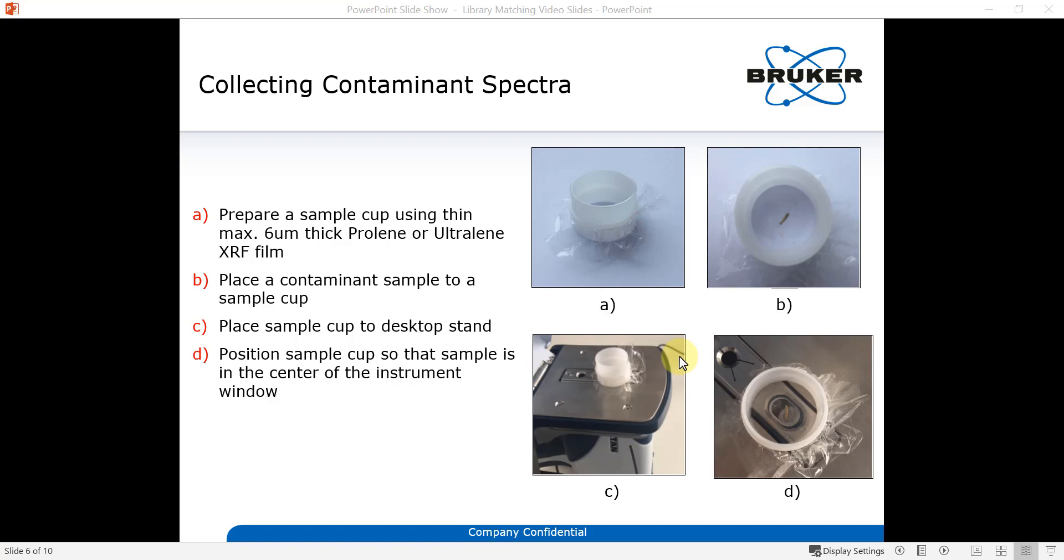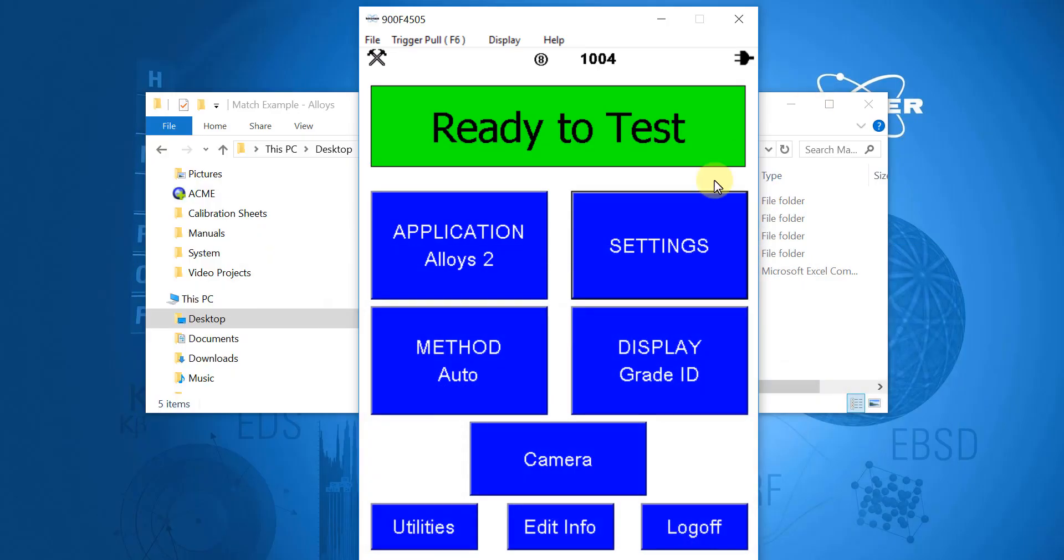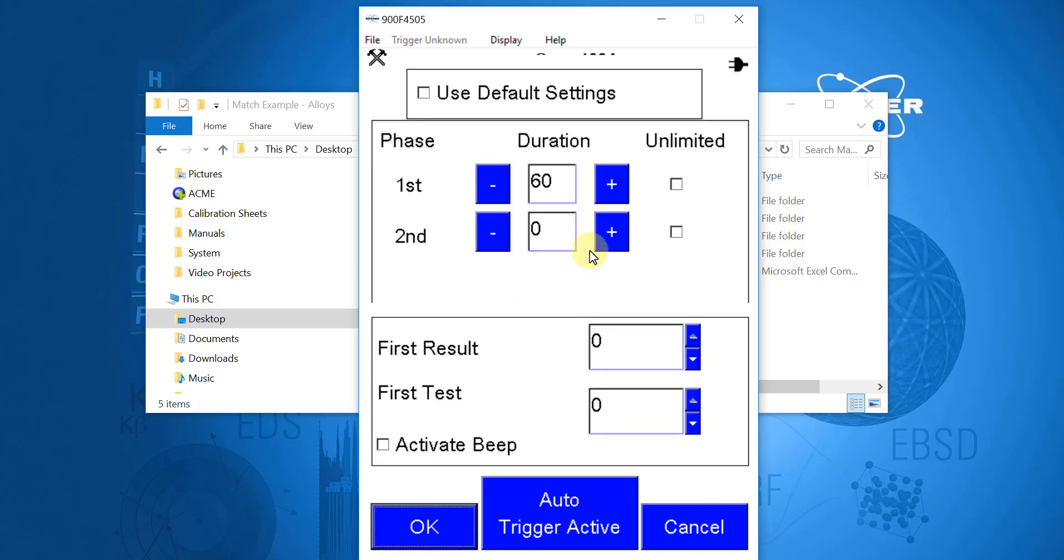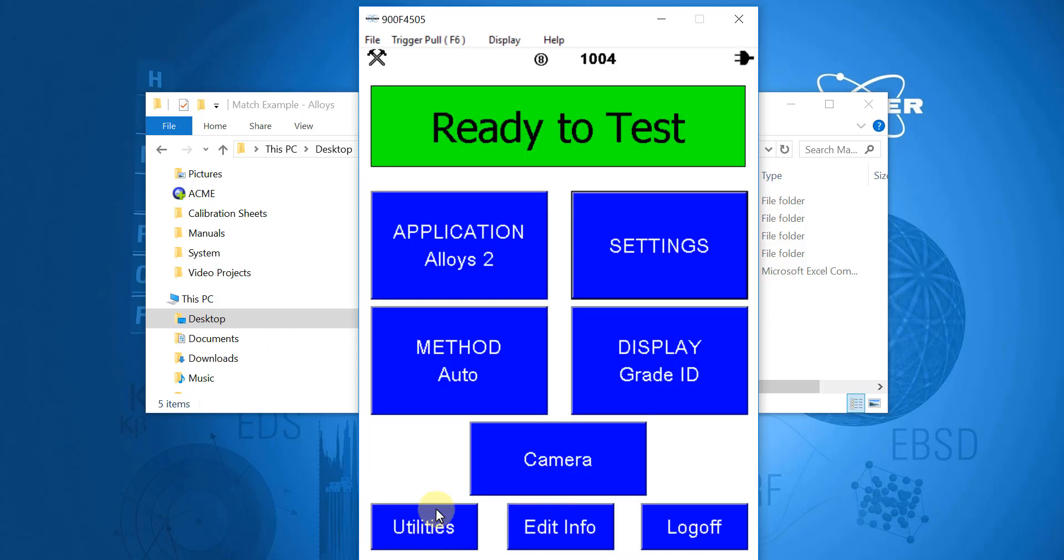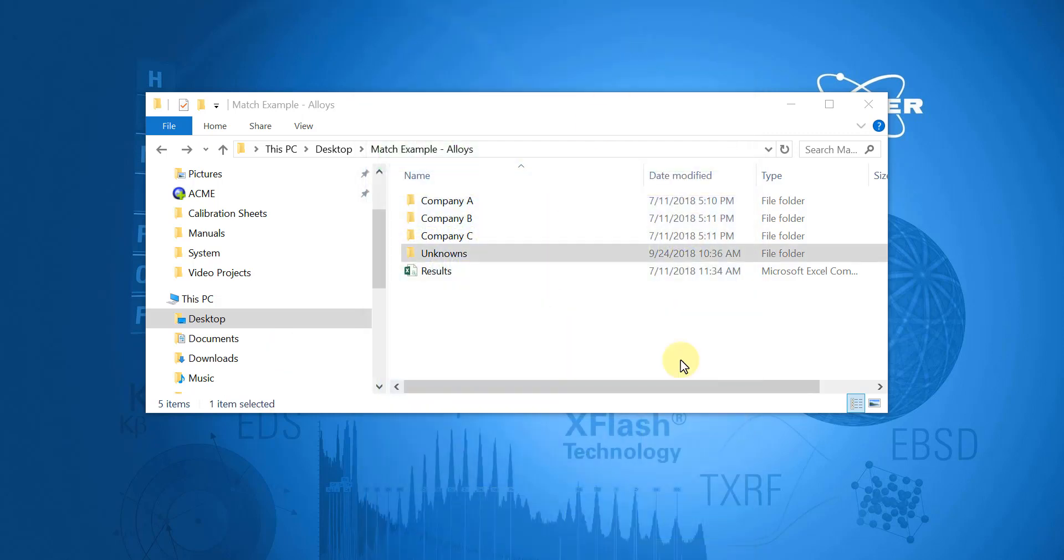For the instrument parameters, it's recommended to use the Alloys 2 application, and then in the settings, set phase 1 to about 60 seconds and leave phase 2 off at 0 seconds. It will be crucial to collect all raw data for references and unknowns using the exact same conditions.